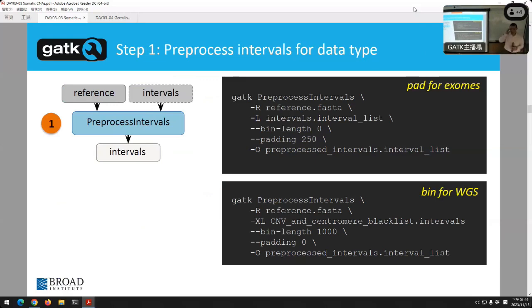By the way, I should explain to you, this is important. When you do exome sequencing, it's also not perfect. So you will definitely get what are called off-target reads. Reads that aren't part of the baits intended, they still show up. We don't want to count those. Those are clearly not expected. So this helps do that.